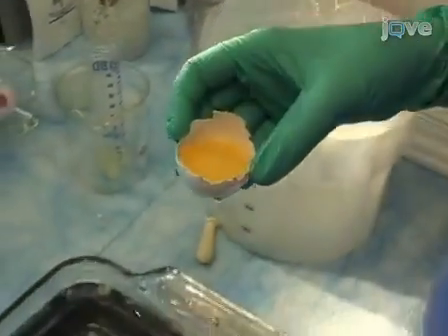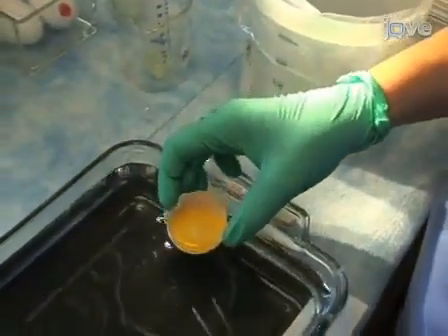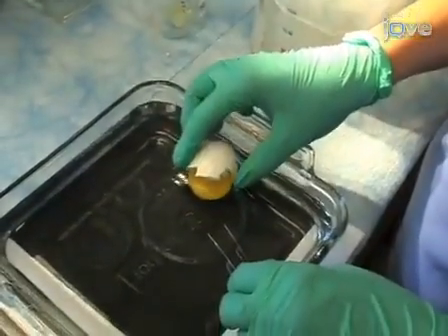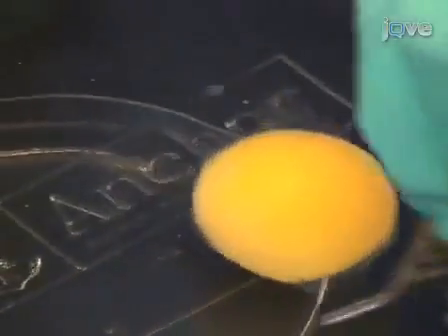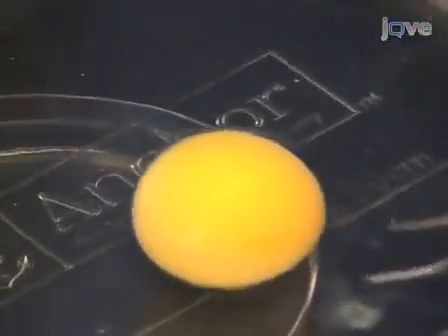Place the embryo in a plastic dish inside the Pyrex dish containing Pannett-Compton saline. Finally, remove the remaining albumin with forceps. Now the embryo is ready to be centered on a ring.